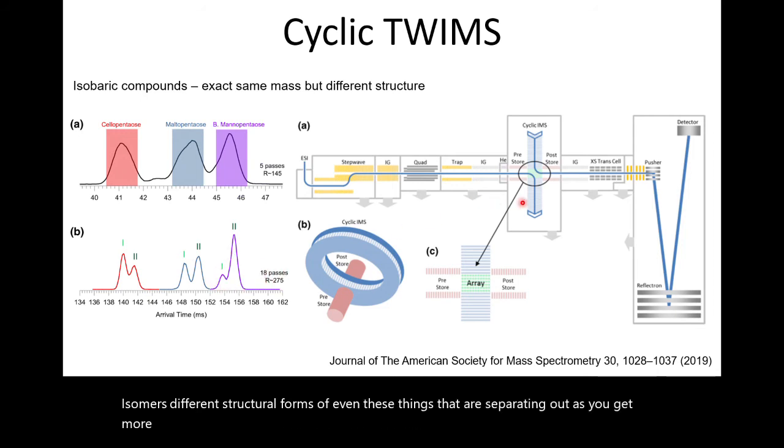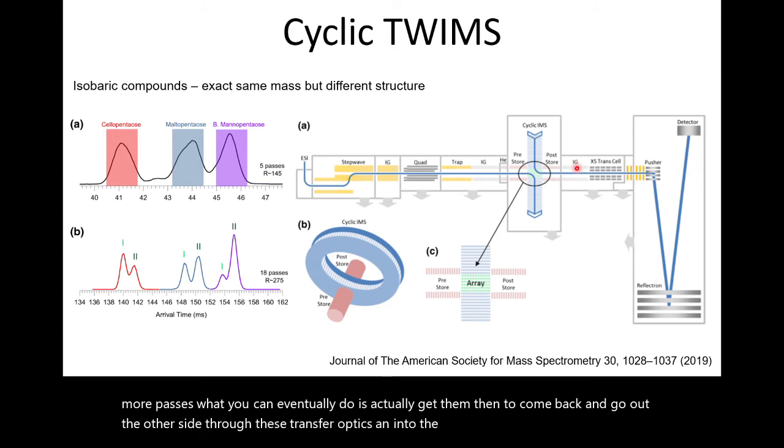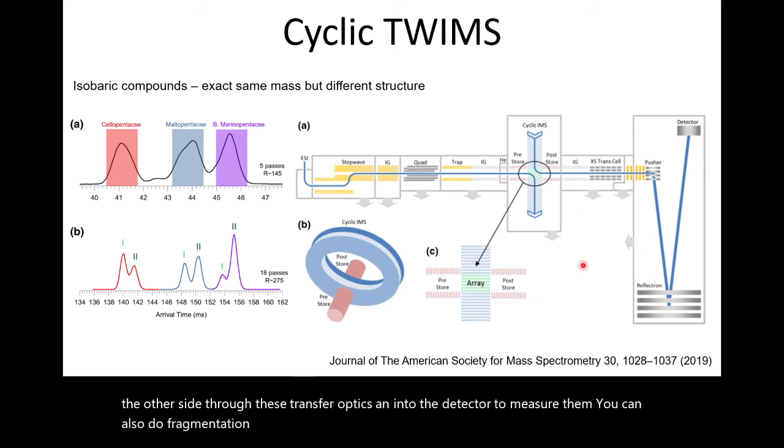What you can eventually do is get them to come back and go out the other side through these transfer optics and into the detector to measure them. You can also do fragmentation on the way out and other really neat experiments. So this is very, very powerful stuff.